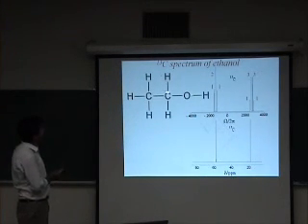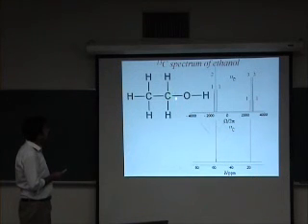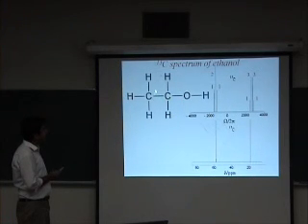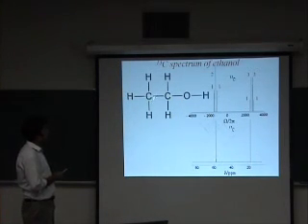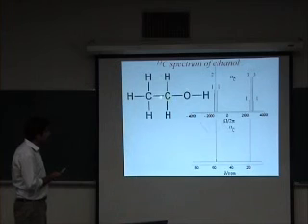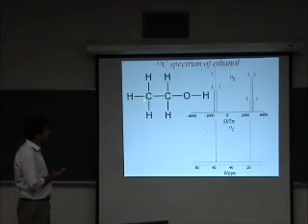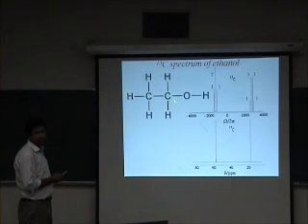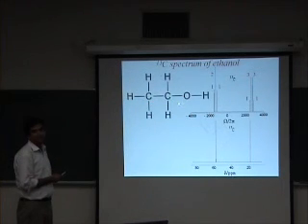Now, observe that in ethanol, if you look at this carbon-13, it is coupled to two protons, and both of these protons have the same chemical shift. If we are talking about isotopomers here, so there is one isotopomer in which this carbon is carbon-13, whereas this carbon is carbon-12, the natural abundance carbon. The other isotopomer is where this carbon is carbon-13 and this is carbon-12. And the least abundant of these isotopomers is when both of these carbons are carbon-13.